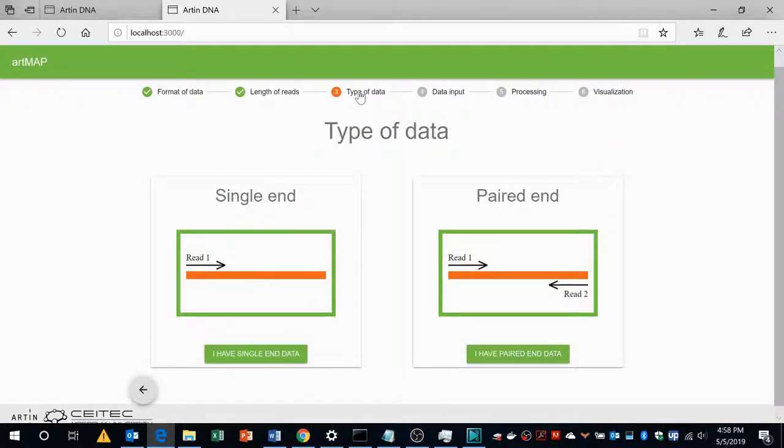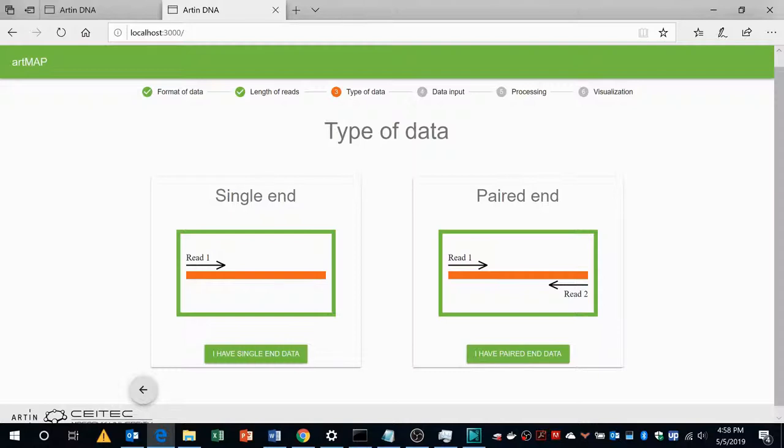And then it will ask about the type of data. Data can be paired end as well as single end. In our case it is a single end data set so I will choose single end.